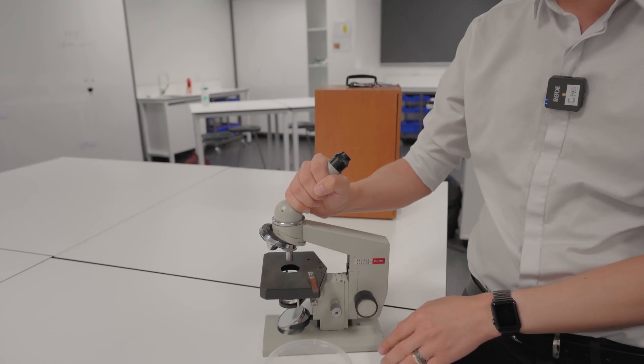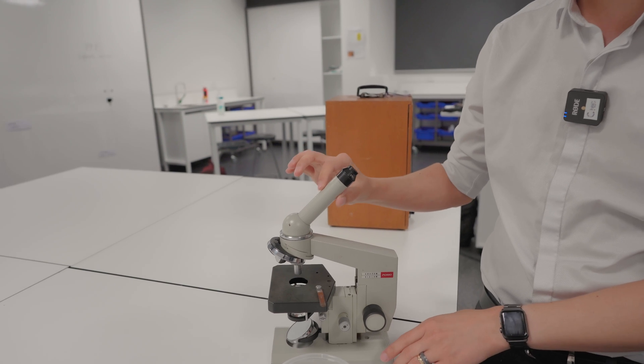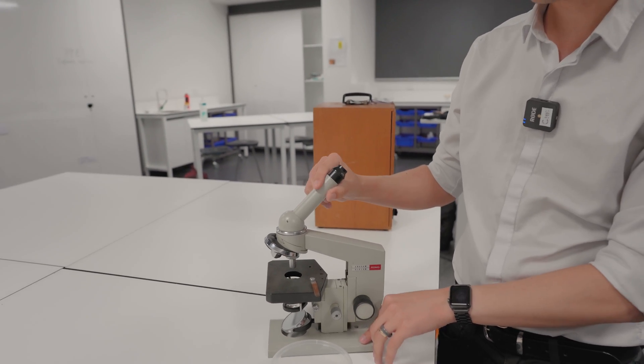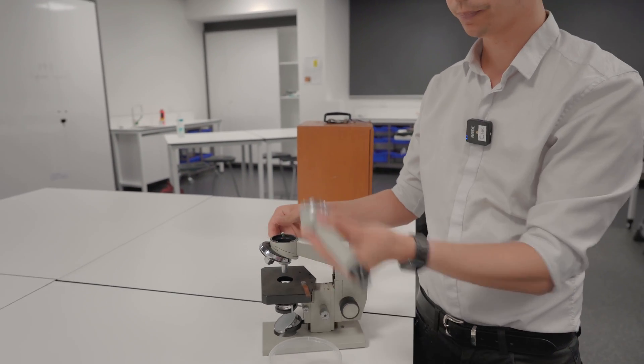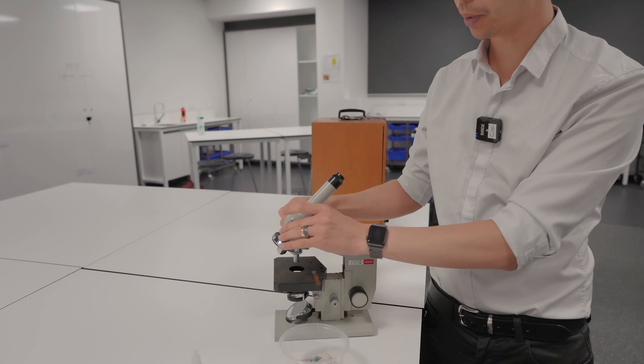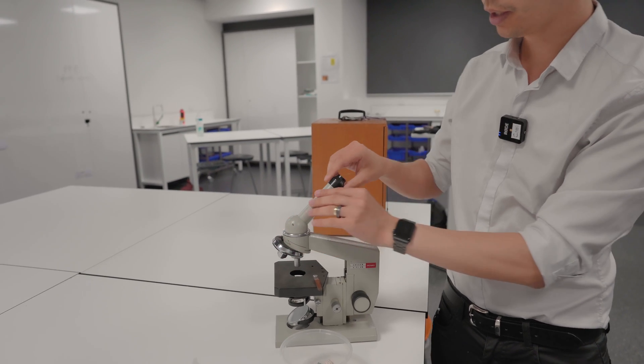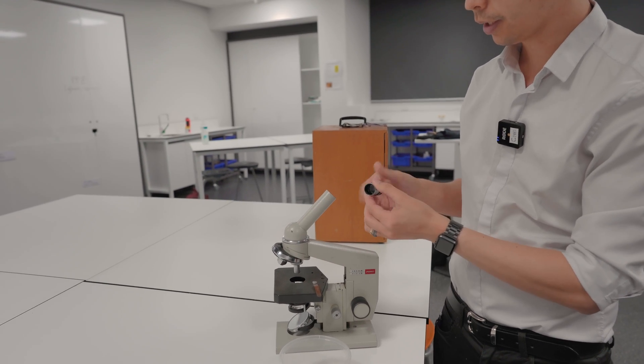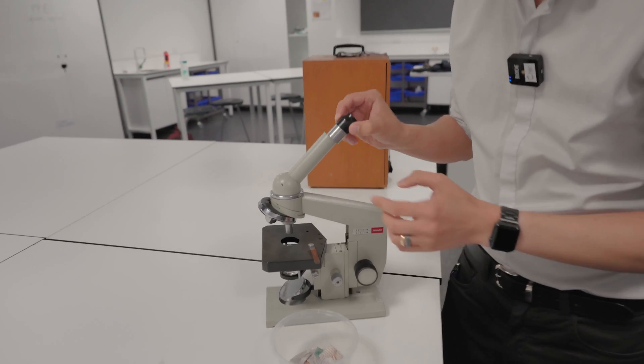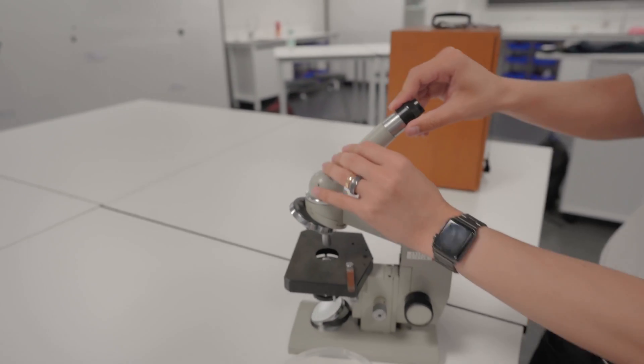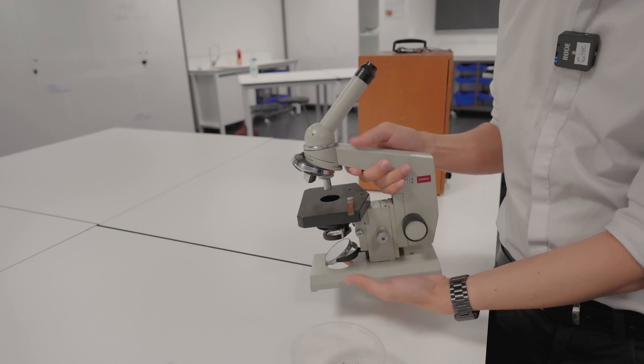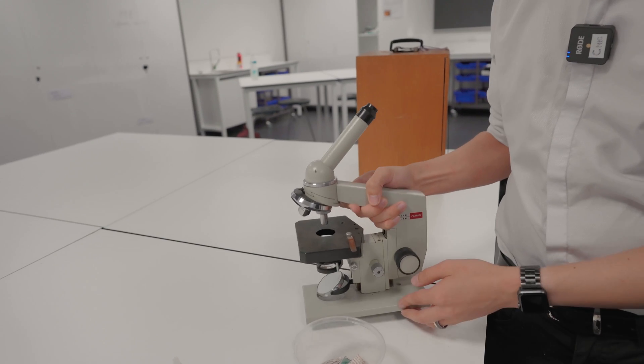I have seen students in the past who have picked them up from this part of the microscope. That's not as secure so this one here actually comes right out. So imagine what would happen if you grabbed that and it came undone. Also this comes undone. I think we need to get a close-up of that. Very satisfying. For that reason you have to go by the arm and the base when you lift it and put it away.